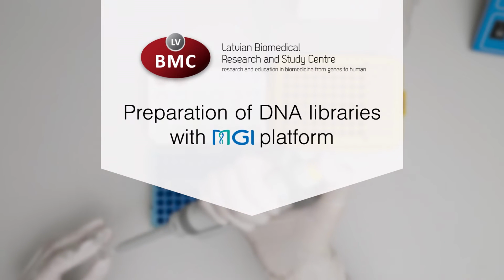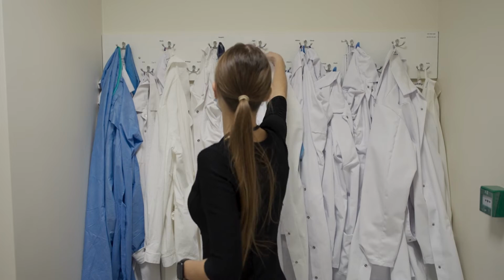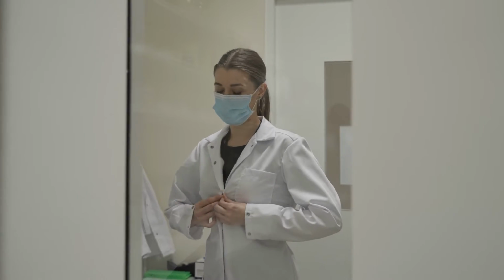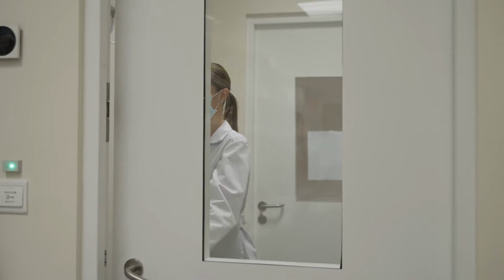Hello! In this video you will learn about the workflow of DNA sample preparation for next-generation sequencing with MGI platform.